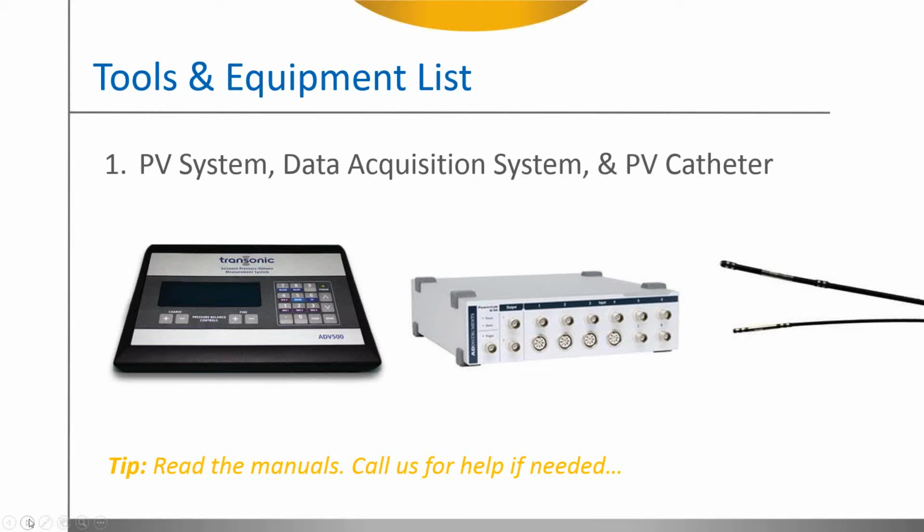So PV acquisition is not a standalone technology. The researcher will be assembling a system or systems of equipment for data collection and surgical needs. It's important that due deliberation be put into the selection of the system components and their use. So at the heart of any PV studies, the researcher will have the PV catheters and control box, the data acquisition and data analysis system.